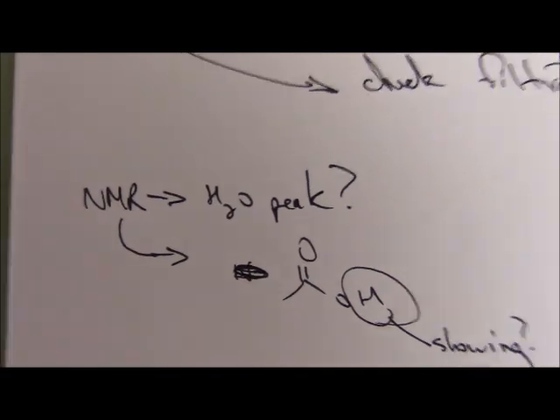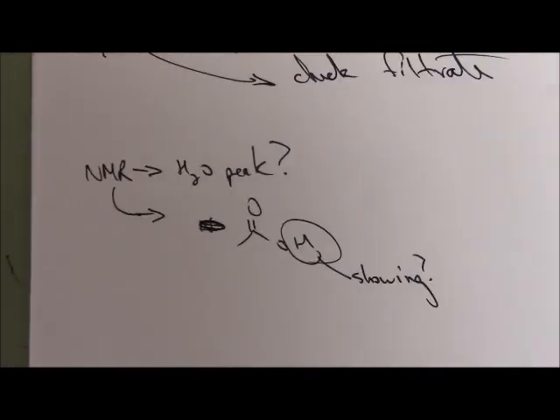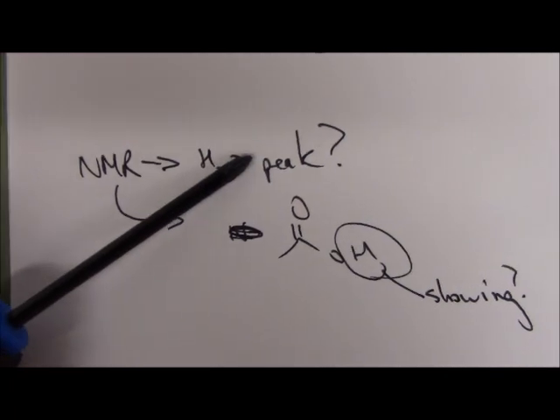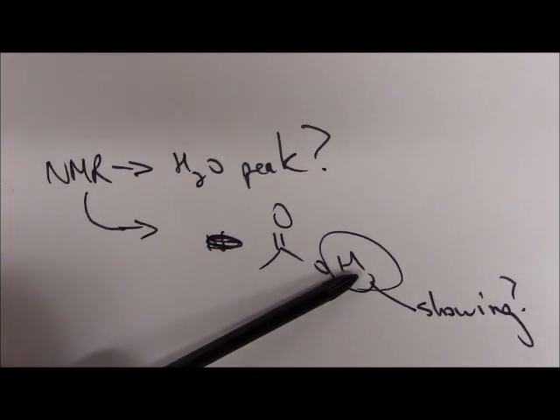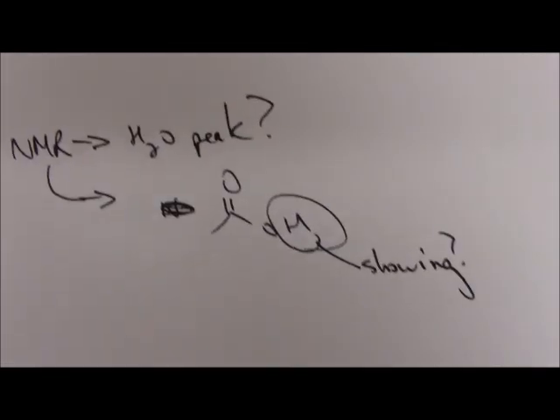NMR. You never discuss IRs or NMRs or spectroscopy unless it indicates something to you other than the product. So that might seem strange. So first of all, there's a water peak. We already talked about that in our yield correction. So that just tells us it's wet. The other thing that a lot of them, we don't see clearly that peak over at 12. It should be there. You go to assign it, it's not there. So you can just make a comment that often it's just so broad it doesn't show up.